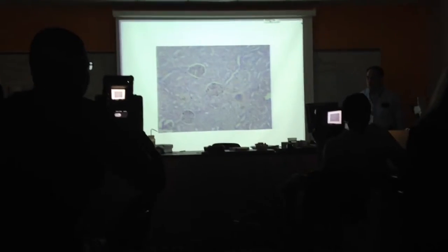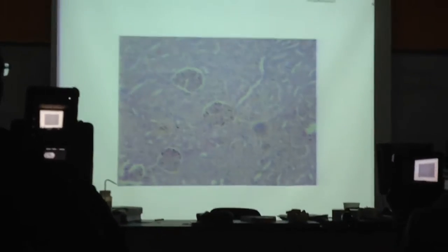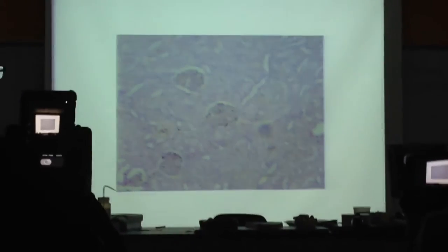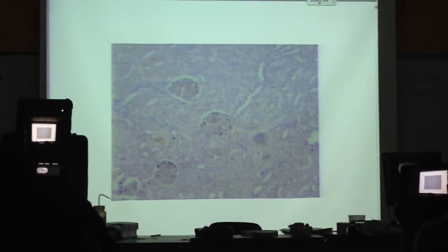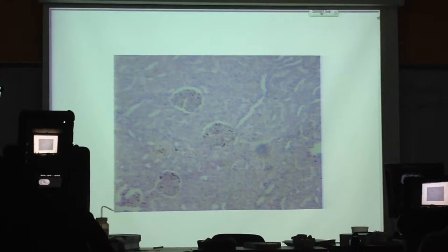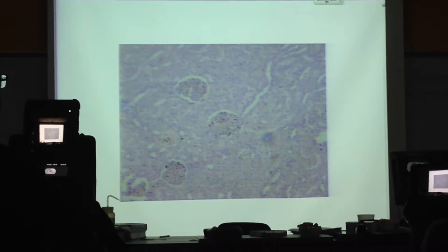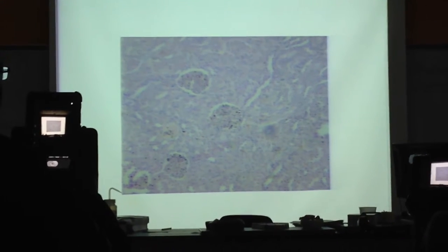Now, most of the renal tubule consists of simple cuboidal epithelium — simple cuboidal epithelium — but there are some exceptions.